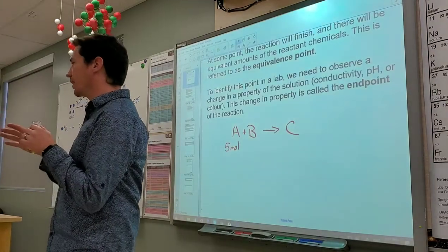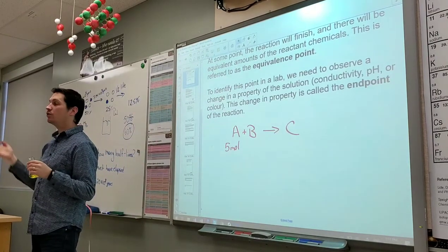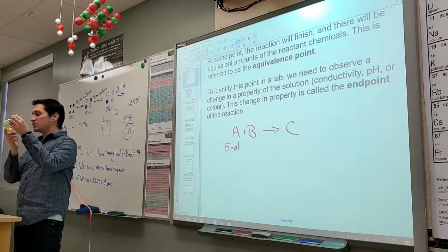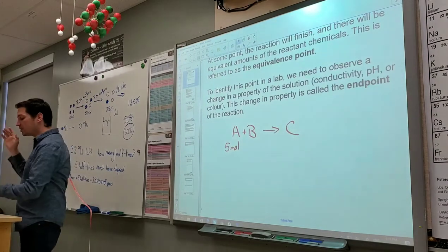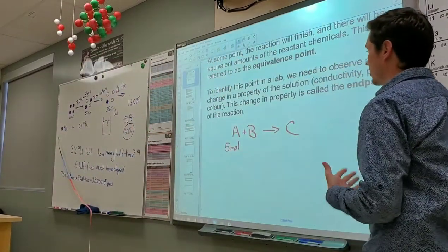Why did it happen so quickly? Yeah, well, I was adding my acid too quickly. That's the problem with that. I was adding my acid too quickly that we overshot our end point. So I'm going to describe some terms, and I just want you to listen up, and hopefully we can understand what these terms mean.